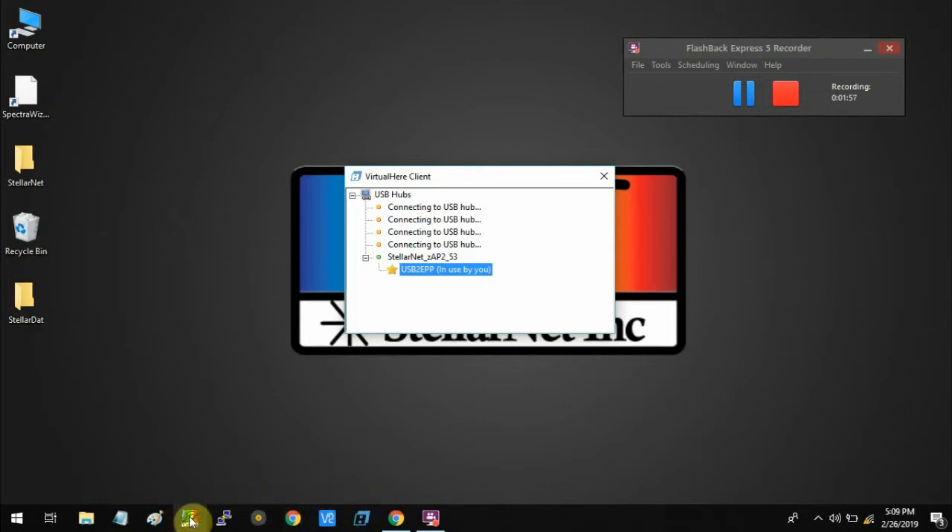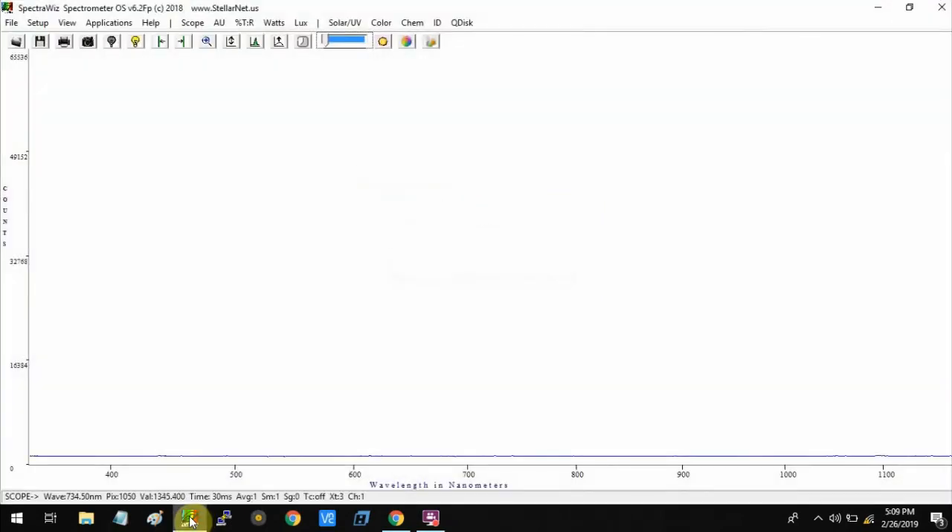Now, as normal, you can open SpectraWay and your ZEP2 spectrometer is connected to SpectraWay without any USB connection, using a Wi-Fi connection. Thank you.